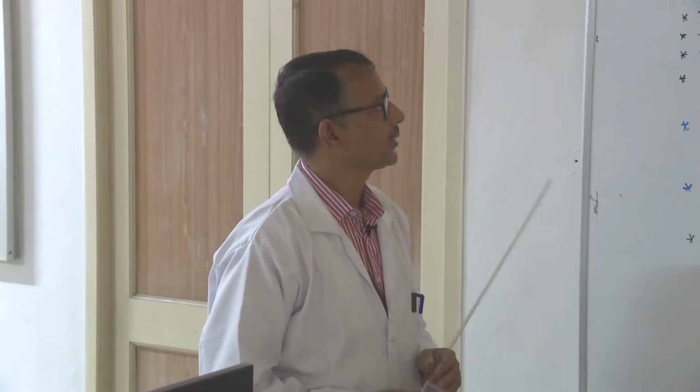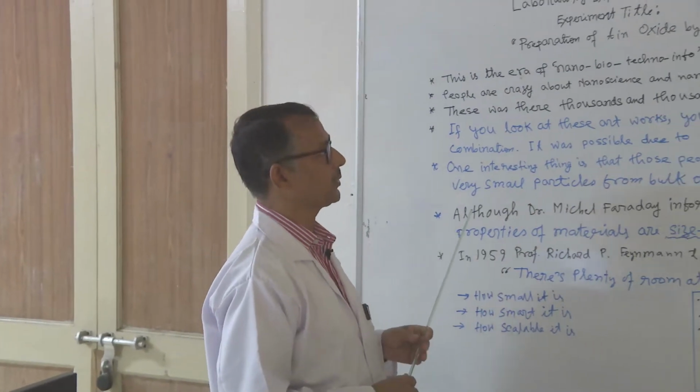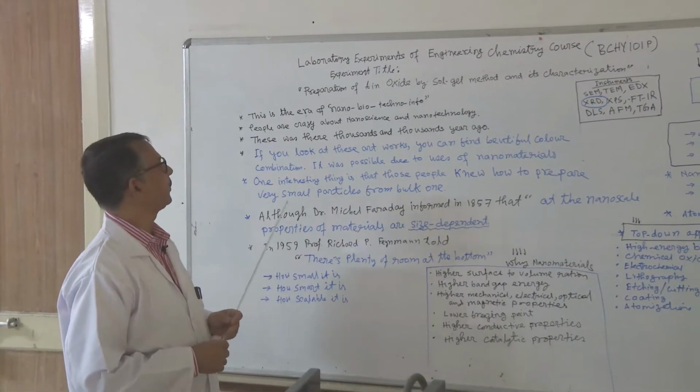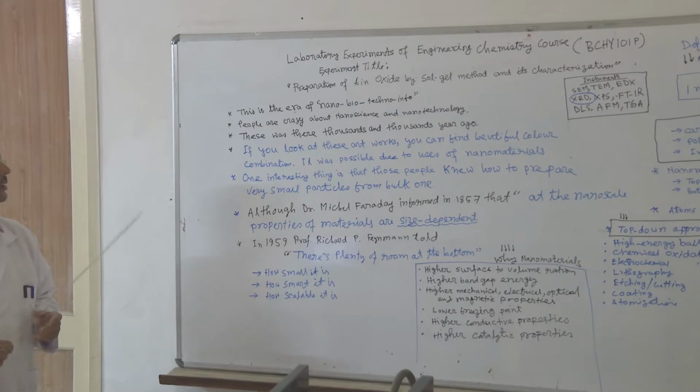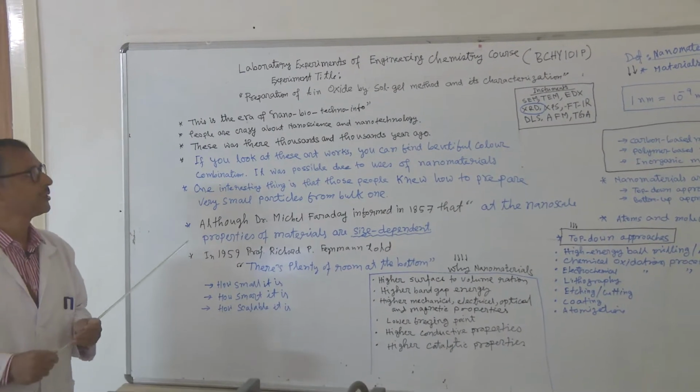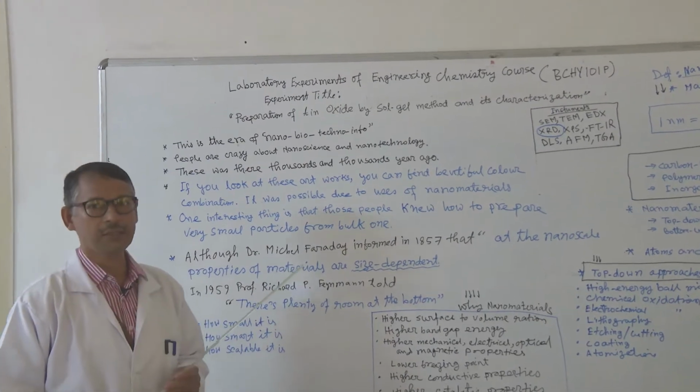Welcome to laboratory experiments of engineering chemistry course BCHY 101P. Today we will exercise preparation of tin oxide by sol-gel methods and its characterization.